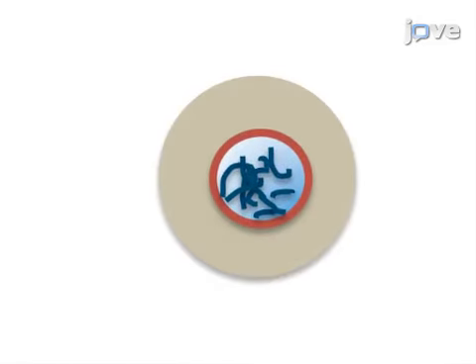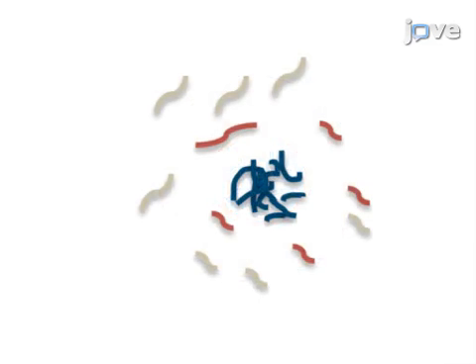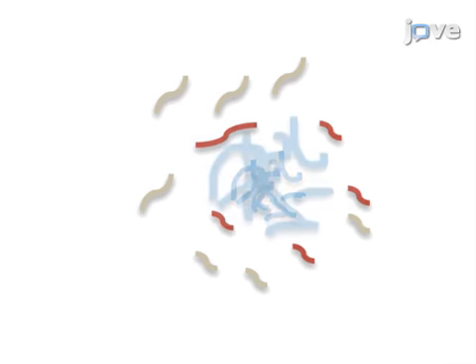The second step is to lyse the cell and nuclear membranes by osmotic shock, usually with the help of a detergent. This is done in the presence of a low concentration of fixative to preserve protein structure. After the cells lyse, the concentration of fixative is increased to further stabilize protein structures.